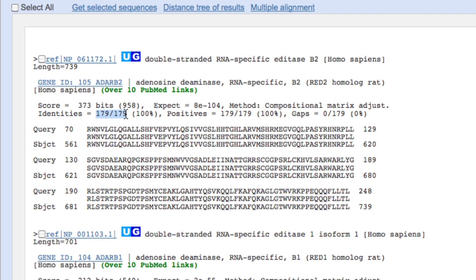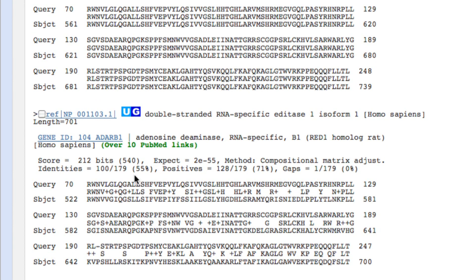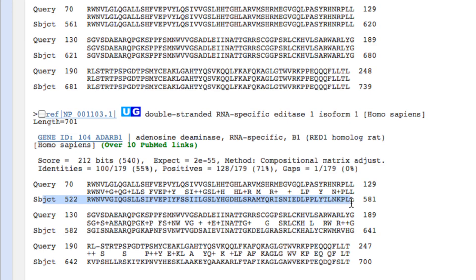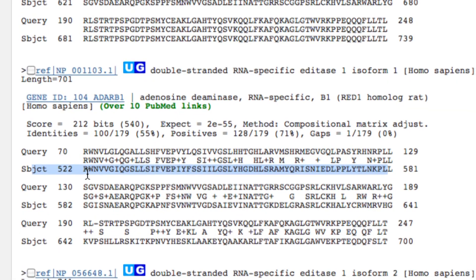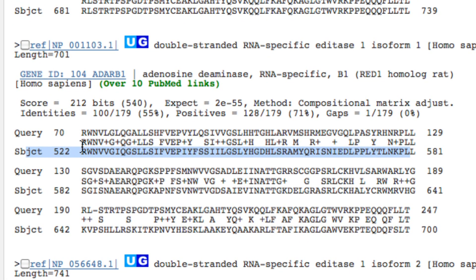Let me show you a sequence that's a little bit different just below it. On the top line is the query sequence — that's what we started with, that's our rat sequence. And here is the second best hit in human at the bottom. You see a series of letters, plus signs, and spaces in between. Any time that the sequence matches exactly, in the middle you'll see a capital letter. So you see an R when there's an R against an R, and that happens 100 times — so 100 out of 179 amino acids are identical, or 55% of the amino acids are identical.